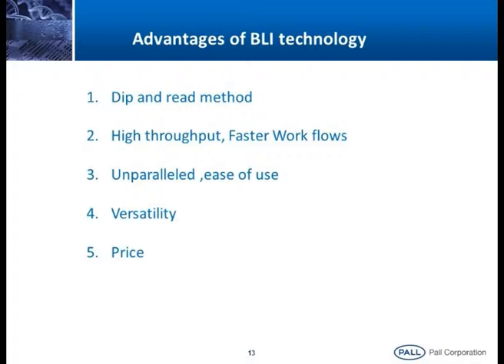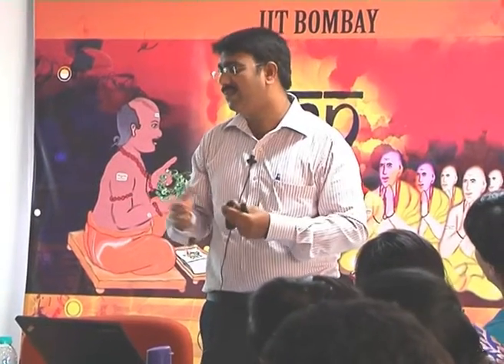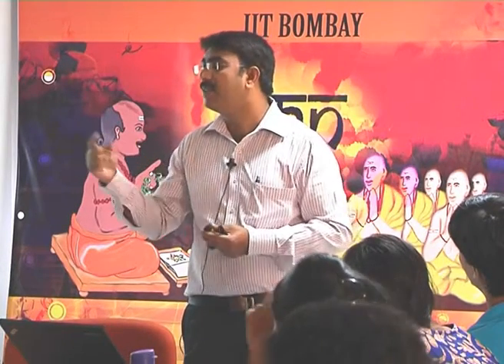In case of SPR, it works on the principle of microfluidics. You know in HPLC there are pumps, peristaltic pumps, that deliver the mobile phases. In case of SPR also, there are buffer systems that deliver the mobile phase or the buffers on the sensor surface. So in microfluidic devices, we can't use crude samples. Suppose you want to do a serum sample analysis, or body fluids, or samples from the bioreactor itself, because they contain so many contaminants, it blocks the flow cell. Once the flow cell is blocked, we have to replace the complete assembly. That is what makes SPR microfluidic devices expensive.